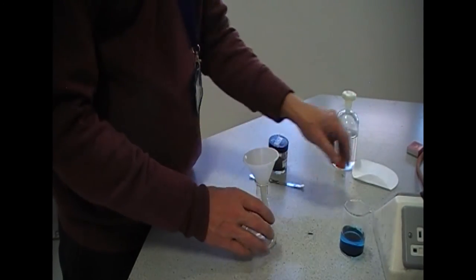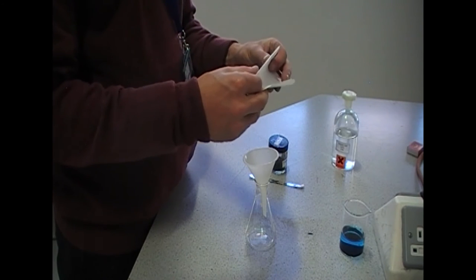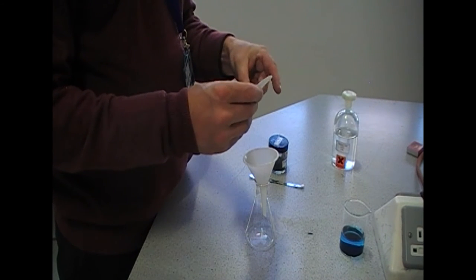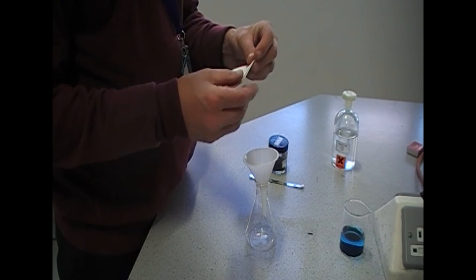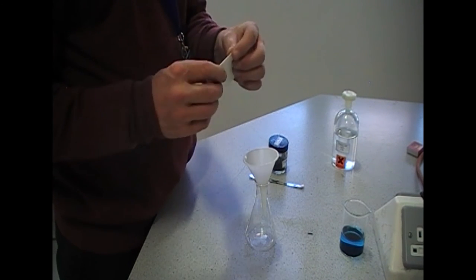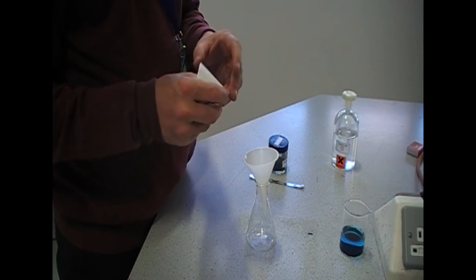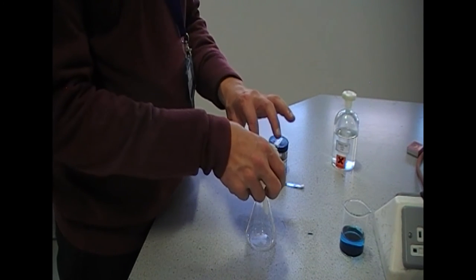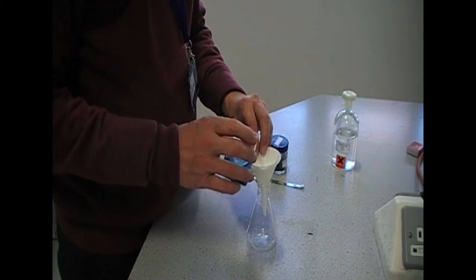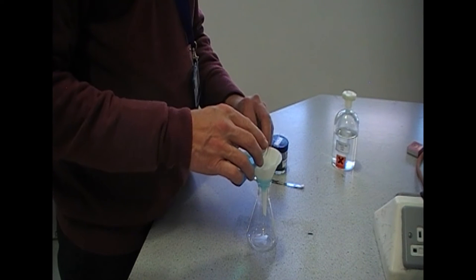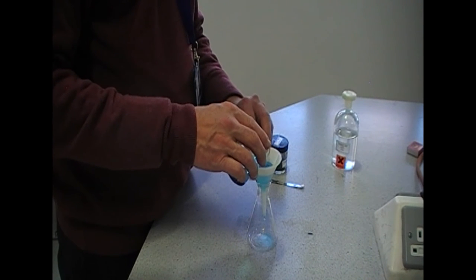Take your conical flask. Your filter paper. Fold it once. Fold it again. Put it into the funnel. And we can now pour our mixture into there.